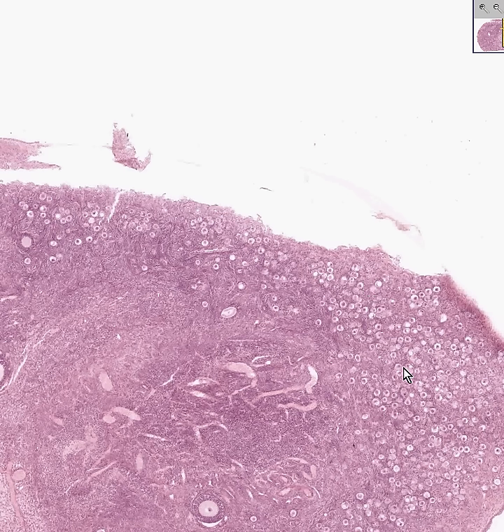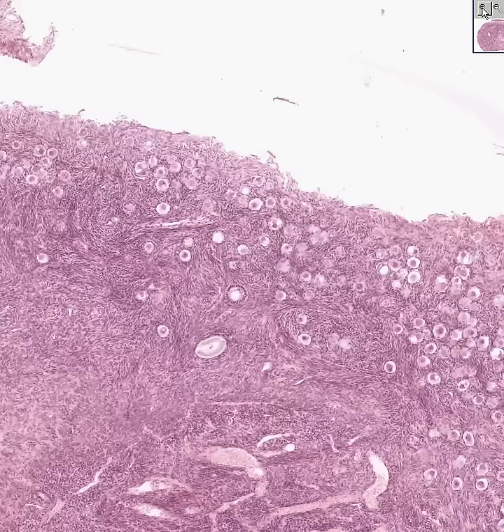All of these individual cells you see here towards the cortex or the periphery of the ovary can be called oocytes, or simply ova. They are the first stage of development of the follicle.